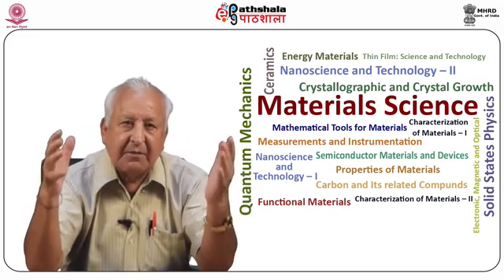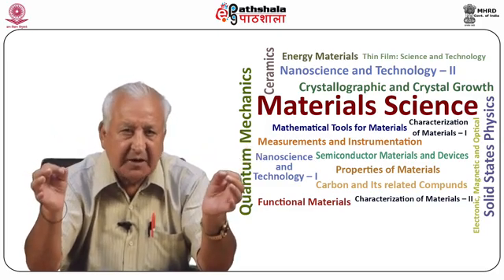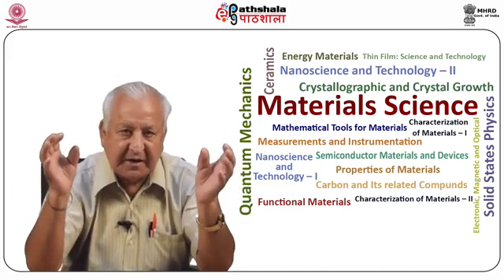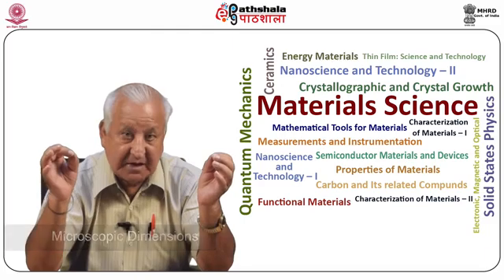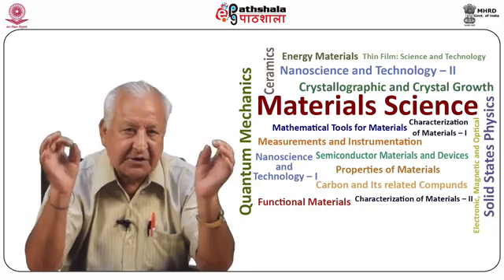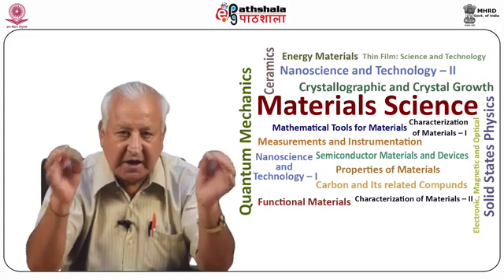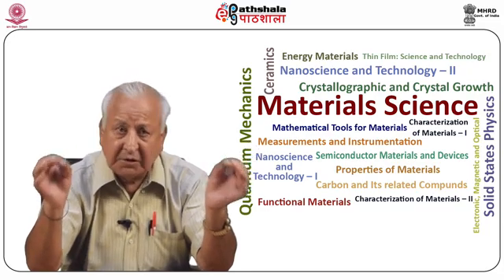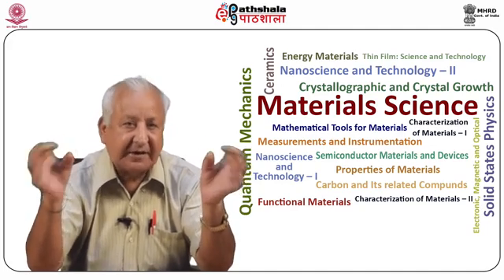The powder crystal method. All the methods, be it the Laue method or the rotating crystal method, require a single crystal specimen whose size is greater than microscopic dimensions. However, in a very large number of crystalline solids, individual crystals of the desired size as required for the rotation photograph either do not occur or are not available. Such materials are readily examined by this method.